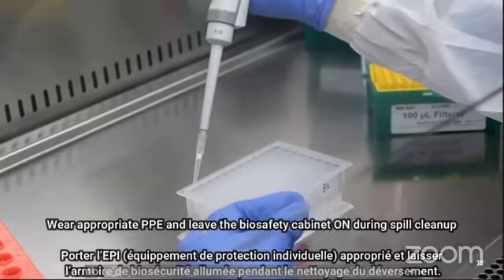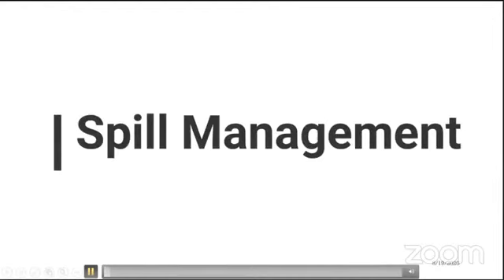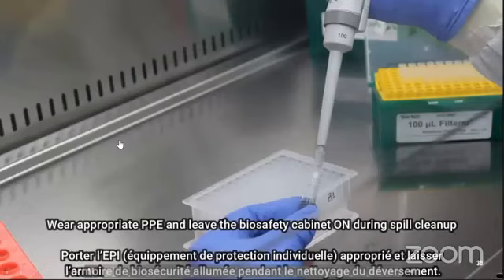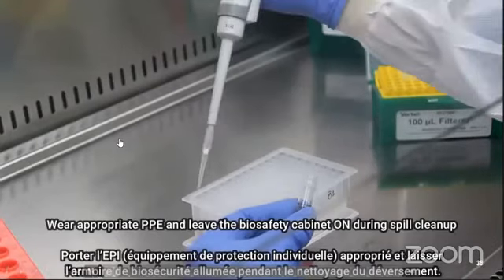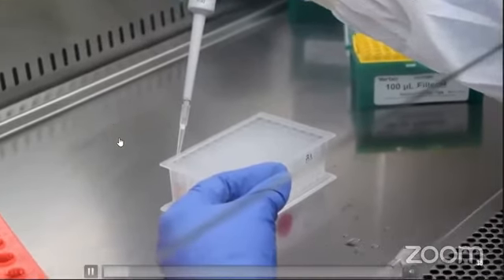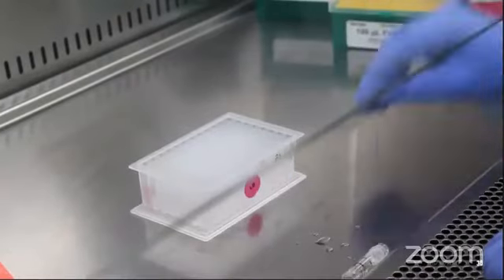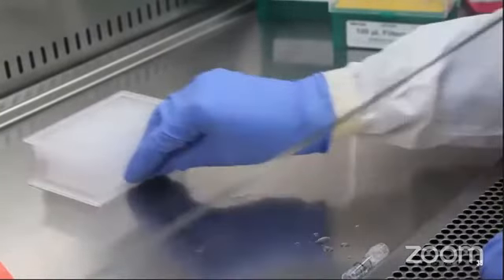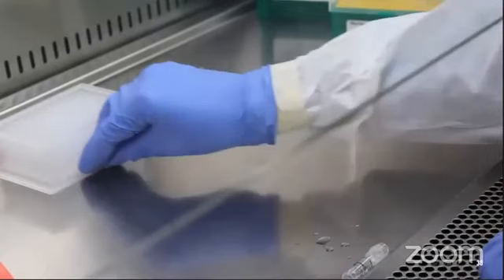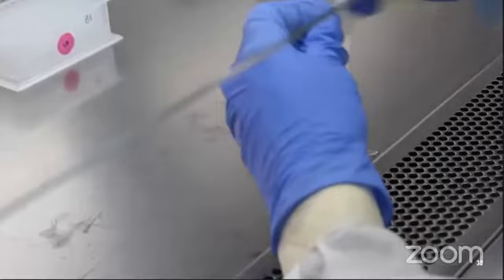Here you can see, during the addition of the sample in the deep well plate, there is a spill of the sample. Pick up the sample tube.